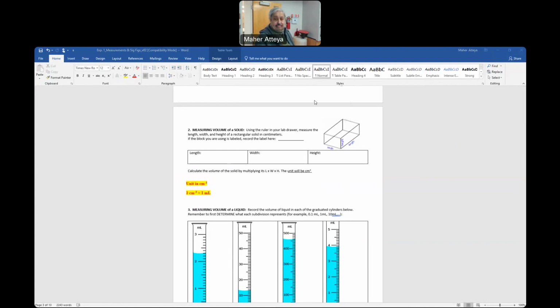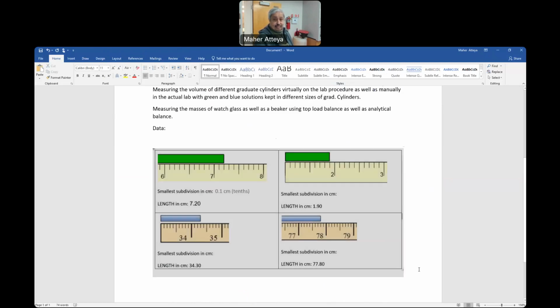I will take first the object here. You can do it; it's just taking a little bit of space here. So the object here, copy. That's the second one, and then come to my. This is the second one, correct? No, not this one. Where's my? Yeah, this one is mine.